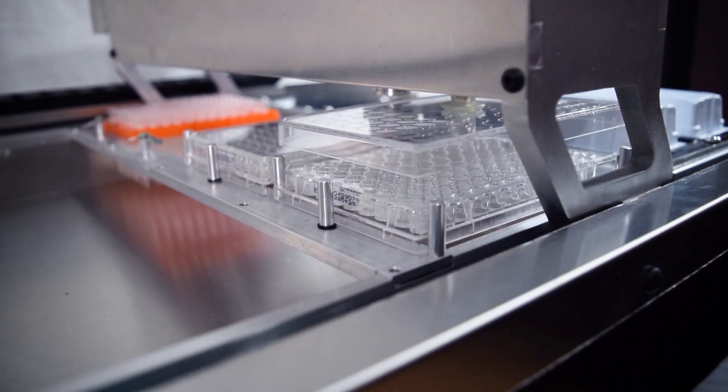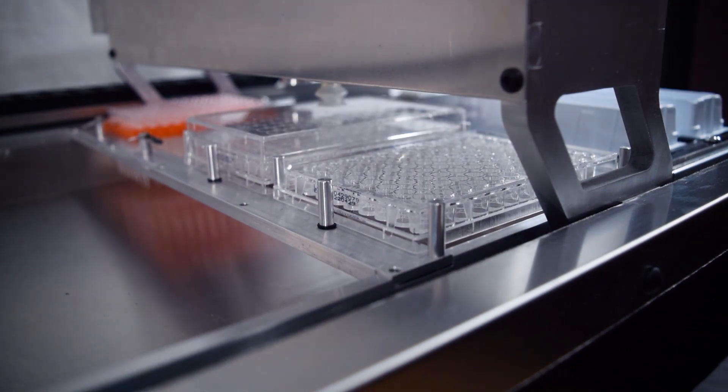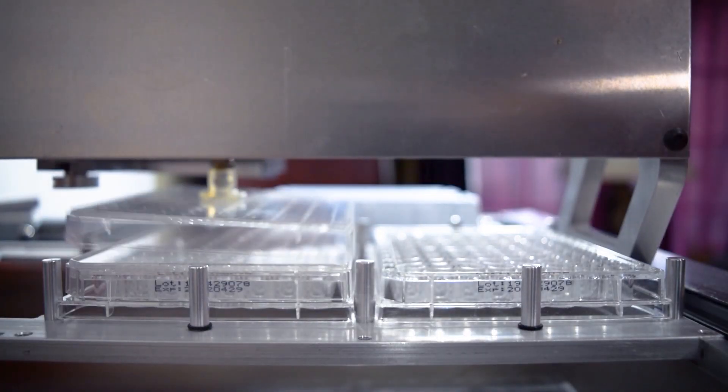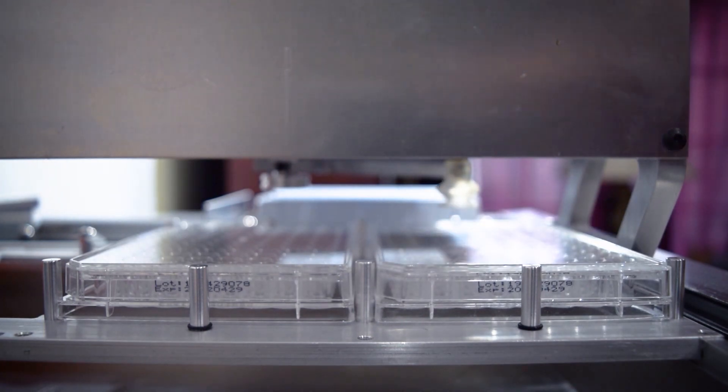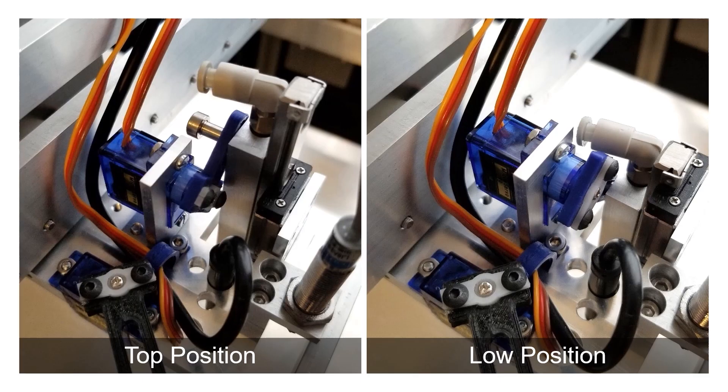Lid removal and replacement are accomplished using a vacuum gripper. The vacuum gripper is driven by a small vacuum pump and the suction is released using a solenoid valve which opens the vacuum line. Here we can see the mechanism which actuates the vacuum cup. A small servo is used for motion and a miniature linear rail guides the motion.